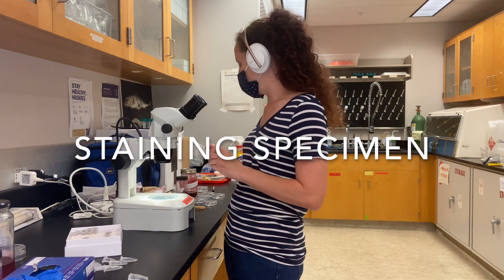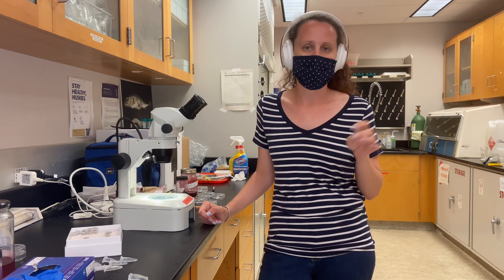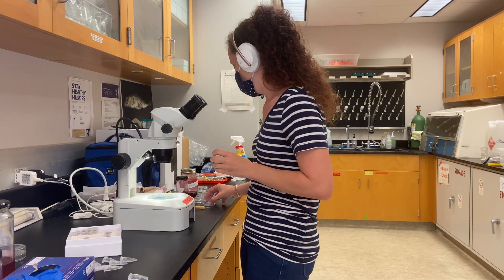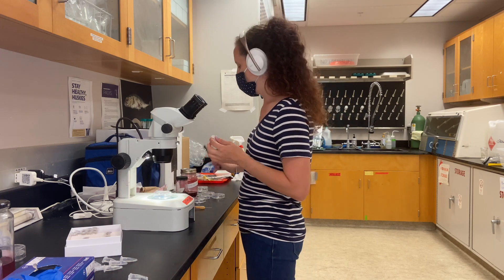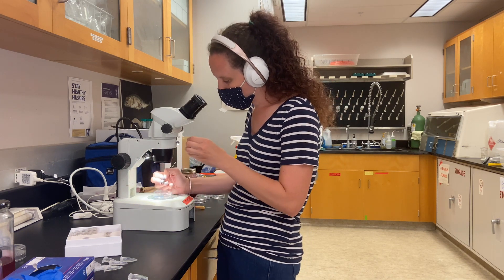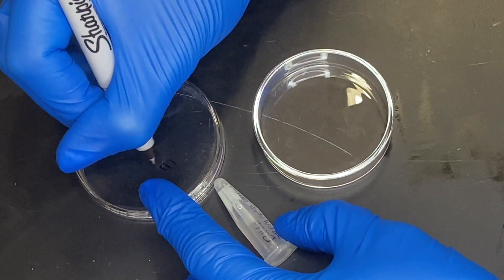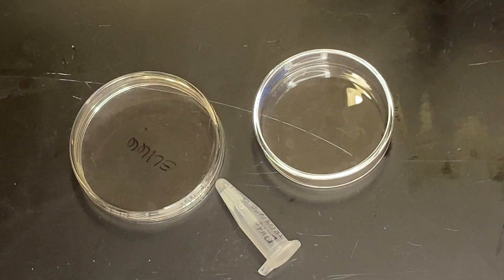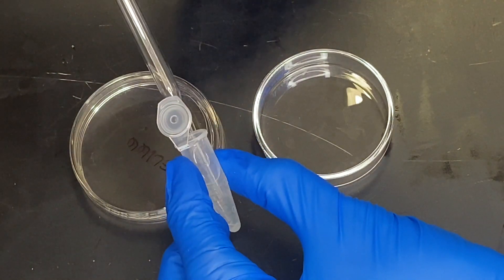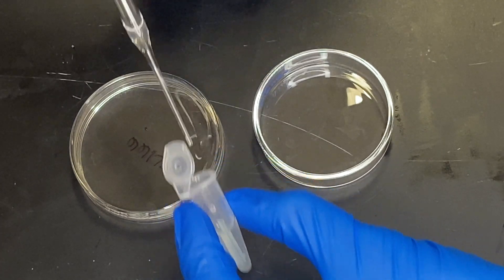We have specimens in a tube — these are stored in ethanol. They were collected from dead fish. So what I'm going to do first is label the petri dish with the specimen number, just something so I know I can tell each petri dish apart. Because these specimens were stored in ethanol, I don't need to add ethanol to my stain. If the specimens are fresh, I can do about half ethanol, half stain. Since these have been stored in ethanol, they're already mostly preserved, so I'll just take a small amount of ethanol along with the specimens and put it in the petri dish.